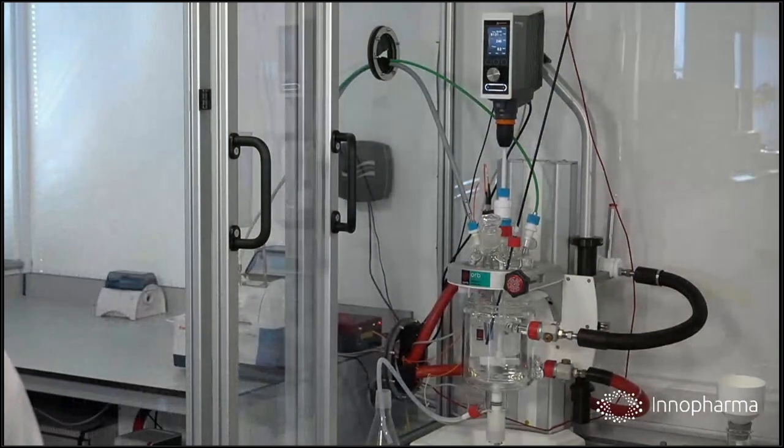Okay, so now it is possible to monitor the crystallization in real time, yes. And in general, that's true. We have some steps to take to process the signal into something useful like concentration. But yes, it is possible to monitor, and we're already doing that. We're monitoring the crystallization, and we'll just do the extra work to convert that into concentrations.